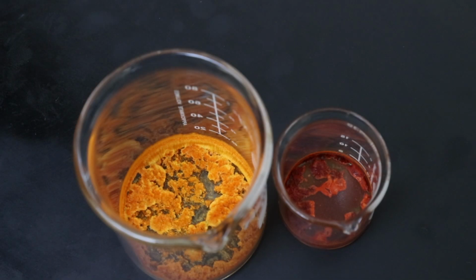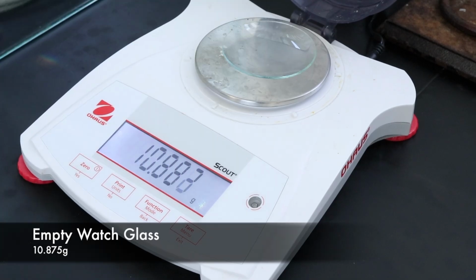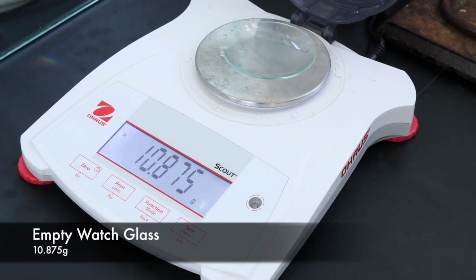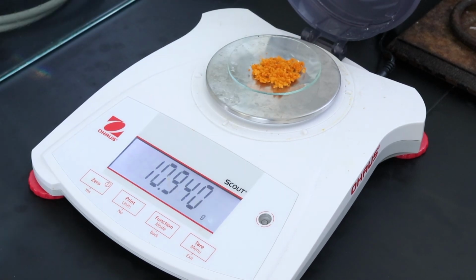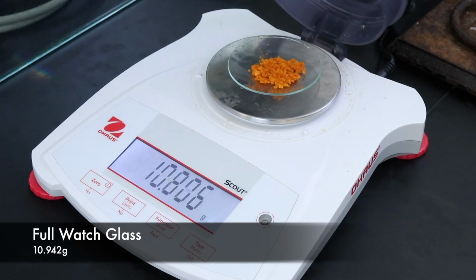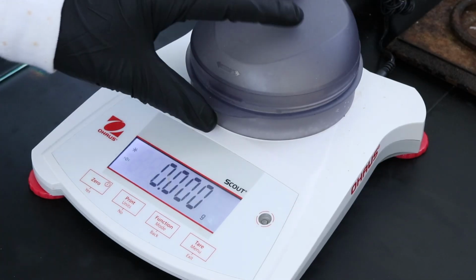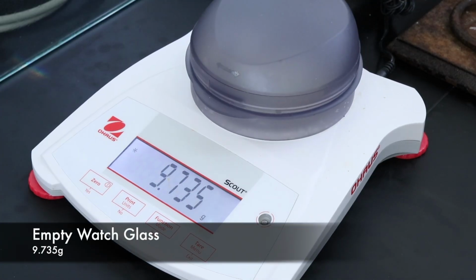Here's what the separated products look like. The left beaker containing the monoacetylferrocene and the right beaker containing the diacetylferrocene. And now we're ready to characterize both of them. I'll first weigh out the two products so that we can calculate a percent yield. I'll start with the mono product and then I'll do the di product. But just remember when calculating your percent yield that it is going to be a 1-to-1 ratio from the ferrocene to the monoacetylferrocene and a 1-to-1 ratio from the ferrocene to the diacetylferrocene as well.